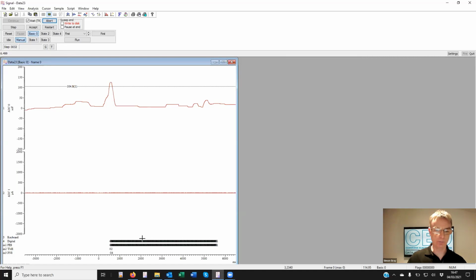It then has to produce some processing on the data that's captured, and you can see the different codes which correspond to the different digital outputs that we've provided for triggering the stimulators. Ready. Go.